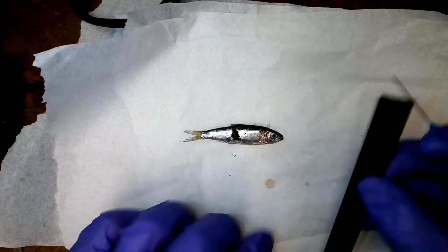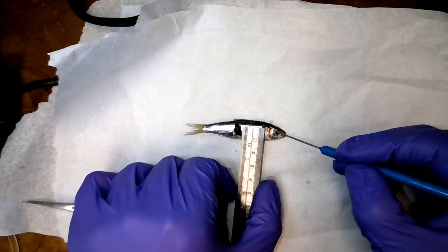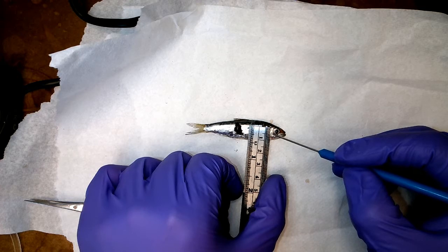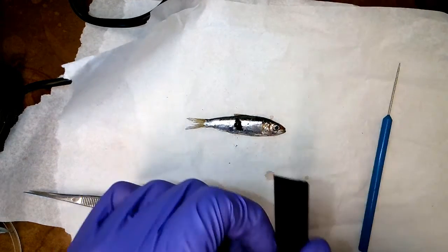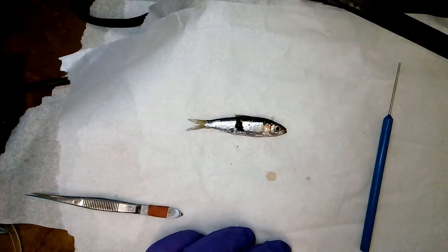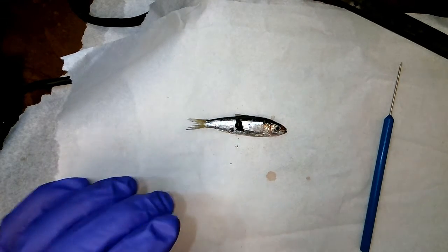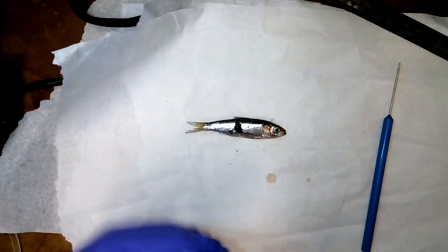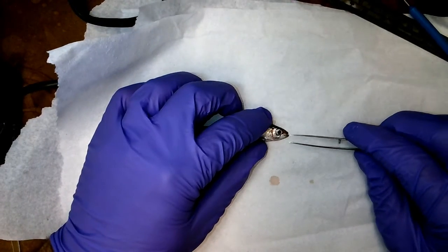Now let's check the depth. You can already see that the depth is going to be quite a bit bigger. So from the top of the cheek, work all the way down to the bottom of the cheek. Here's 5, about halfway. We're looking at closer to 9 to 10 millimeters. So this cheek is deeper than it is wide, which suggests that this is an American shad. Now, that's helpful, but let's take a closer inspection at the jaw configuration itself, the lower jaw. We talked about the difference between river herring and shad in a prior class, but let's really take a closer look at this.